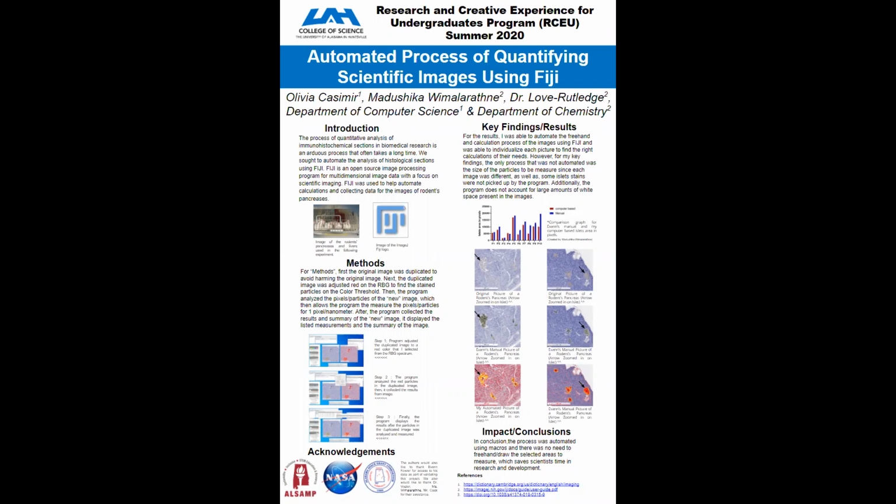For my presentation, I will be discussing the automated process of quantifying scientific images using Fiji.